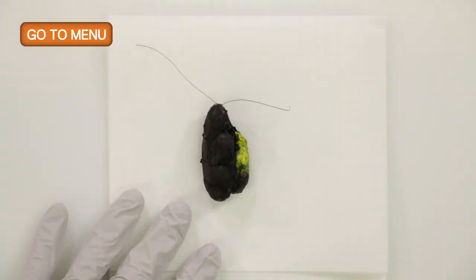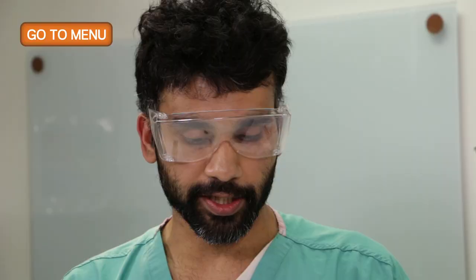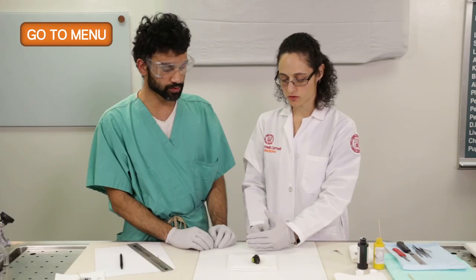In general, when we have a nodule that's greater than 2 centimeters, we like to go ahead and cut the lobe coronally. So we do coronal sections. If it's less than 2 centimeters, then we do transverse sections. So in this case, because this is 2.3, we would want to do coronal sections. Do you know why we do that?